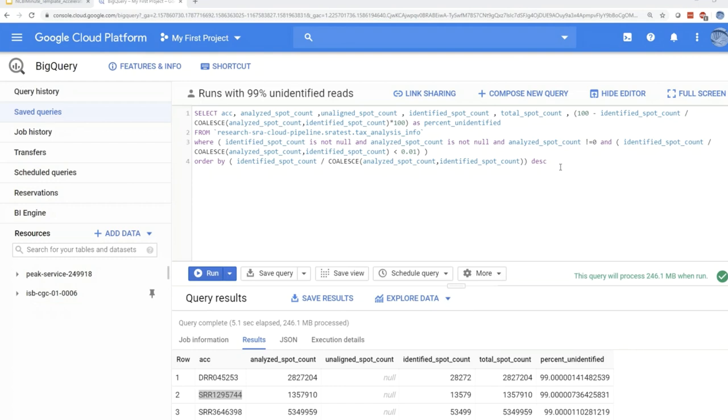But the actual process itself is not any different. So in this case, I would just be calling up an assembler and providing data to it. I don't have a demo available right this minute, but I'm sure that SRA can make a demo of that and share it.